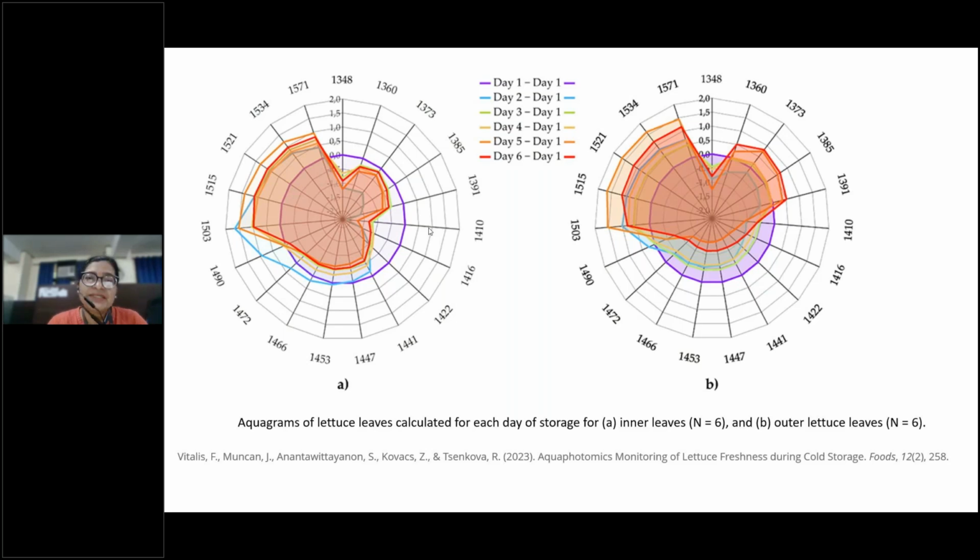You can test it, right? You can test, does it have a tightly bound water structure? It has a loosely bound water structure. But there is a big difference. Both shapes look similar, right? But in the second shape, you can see there are leaves with loosely bound water structures. Why? Because these are the outer leaves also.